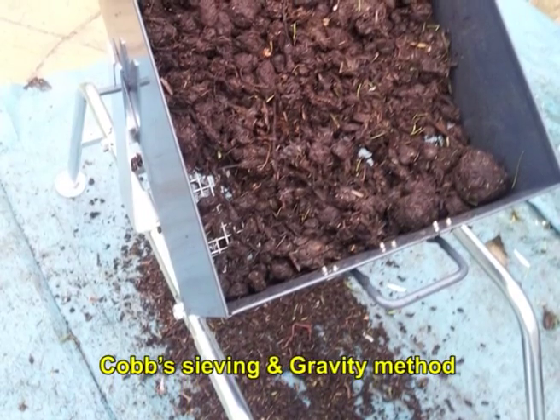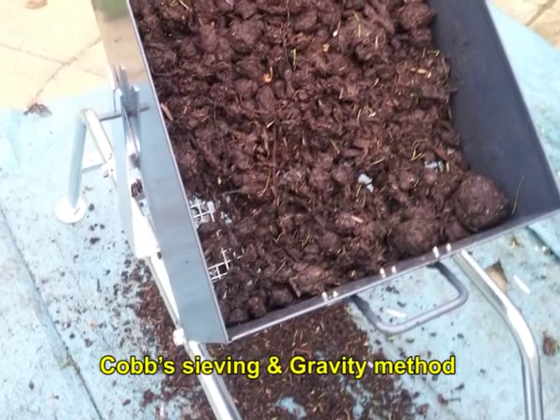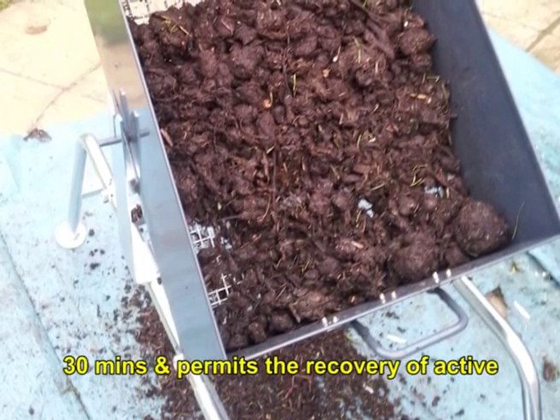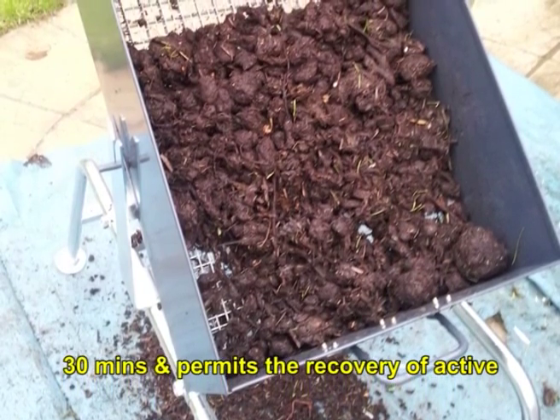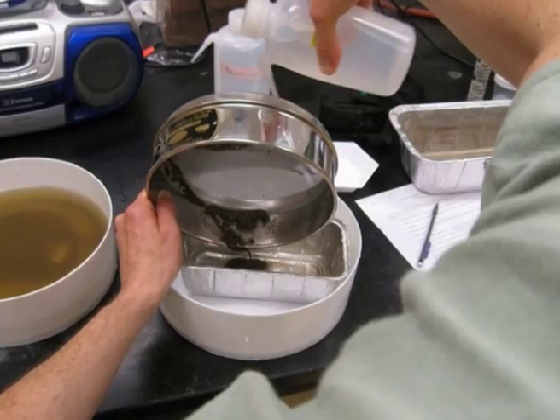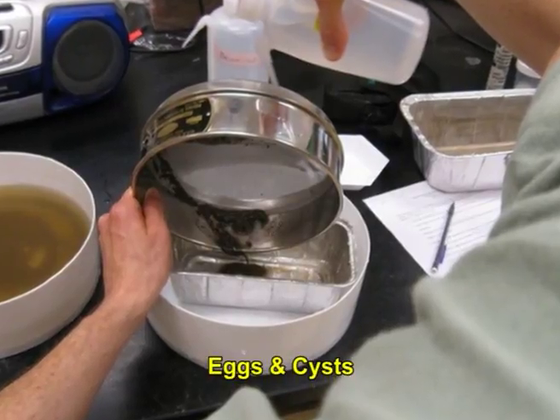Cobb's sieving and gravity method is a swift method, taking less than 30 minutes, and permits the recovery of active, sluggish and some dead nematodes from large soil samples. This procedure enables the recovery of eggs and cysts as well.